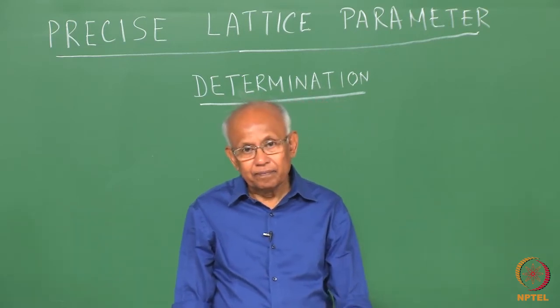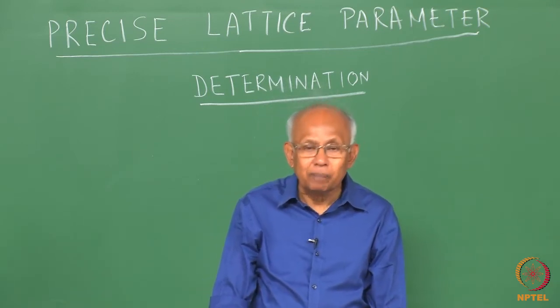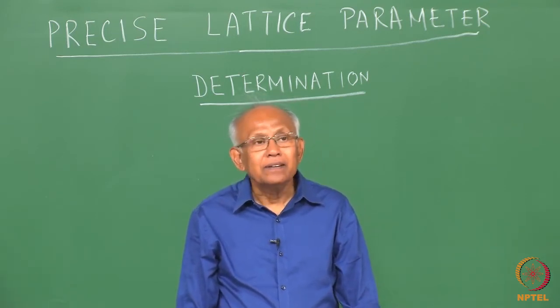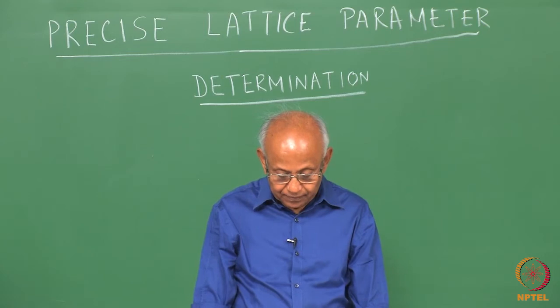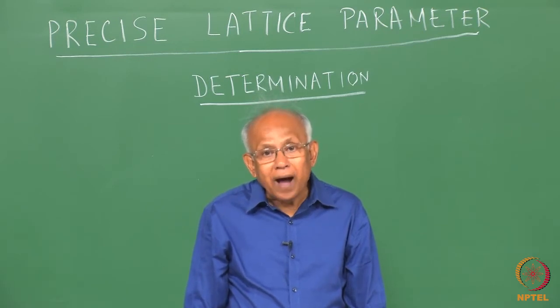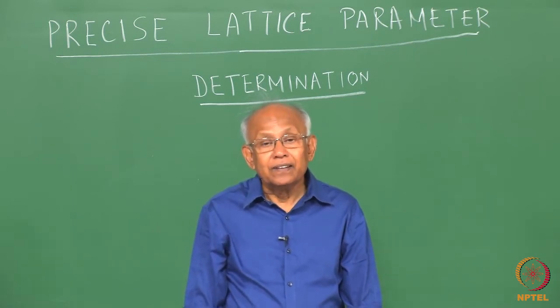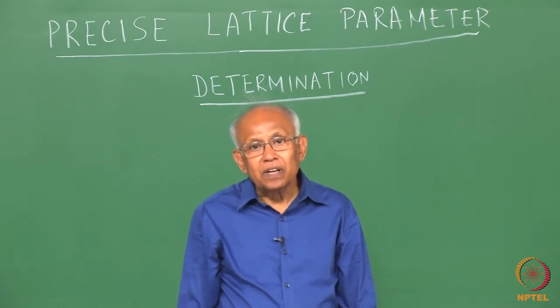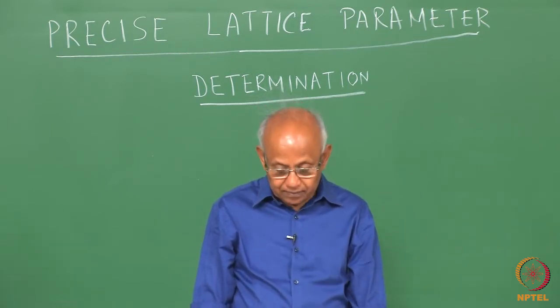I had suggested that the most accurate value of lattice parameter or parameters could be obtained by considering the highest angle line in the diffraction pattern. Today, I am going to explain why I said so. At the same time, I shall also describe the procedure of calculating the lattice parameter or parameters very precisely following some method.